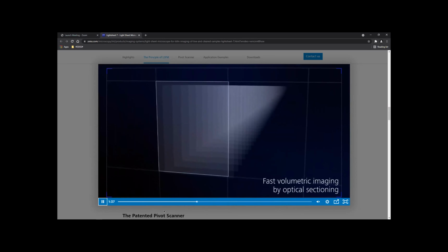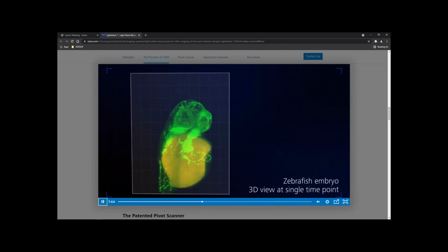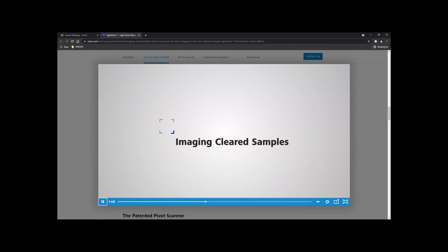And it's, of course, ultra fast because the cameras work at this point in streaming mode, and you can do it within a few seconds. You can get an extremely large, like 1,000 Z-stack image.